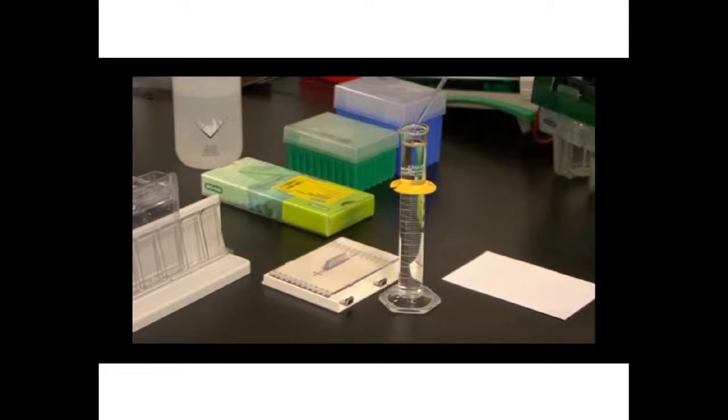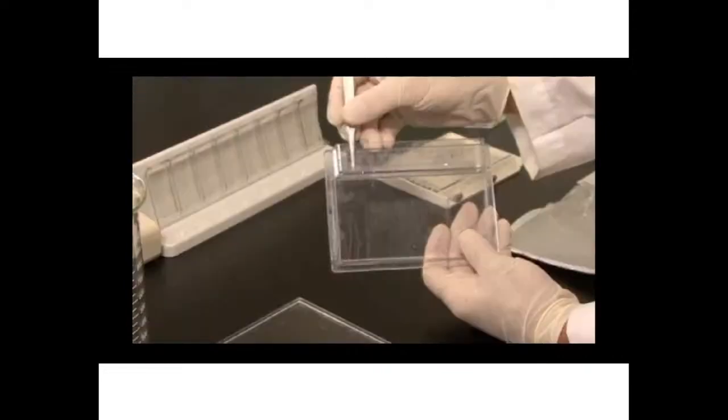Position the strip centered in the middle of the well with your forceps and gently push on the strip until it touches the gel. And you can tell when it's touching because you'll feel a little bit of springiness, a little bit of resistance. Don't push too hard.